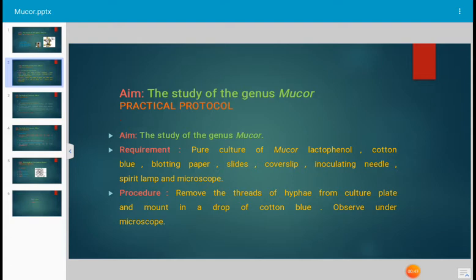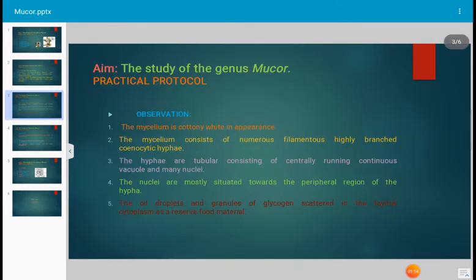When the culture is ready, remove a single thread or a few threads of hyphae from the pure culture using a sterile needle in laminar airflow under sterile conditions. Mount that hypha in a drop of lactophenol cotton blue and observe under the microscope, then record your observations.